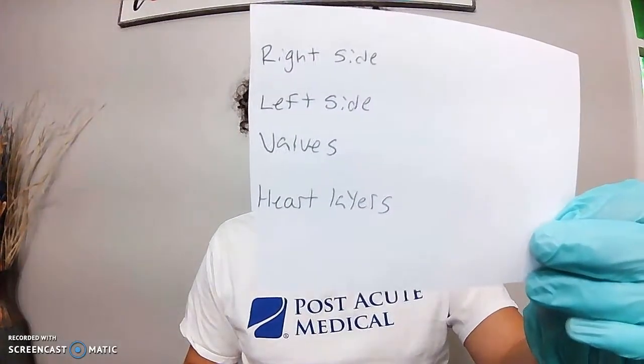Today I'm going to be doing the Module 9 video presentation, the sheep heart dissection. Here's my little flashcard with the topics I'm going to cover.